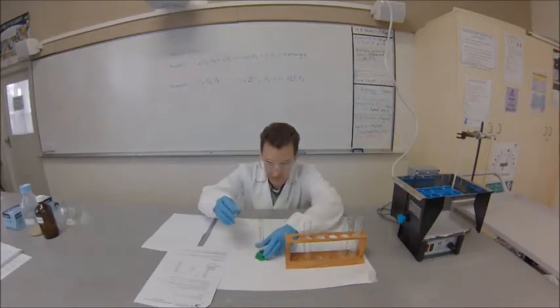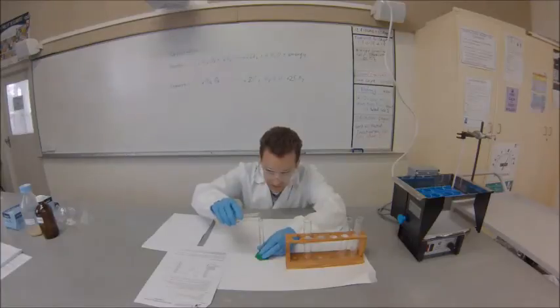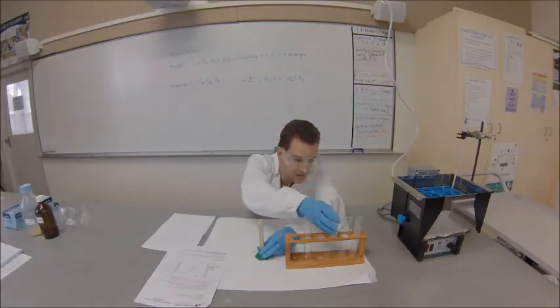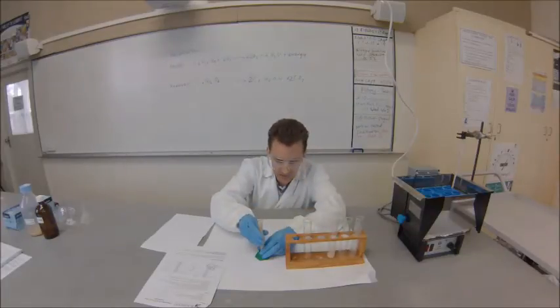Hold that steady and pour it in. Then carefully take that out.